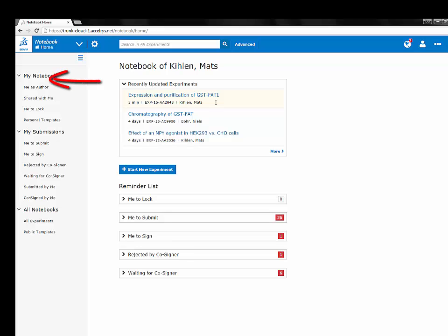Predefined filters on the left hand side of the page now allow you to quickly access experiments from the library or view experiments where you are a contributor. You can also view your own or public templates from this menu.